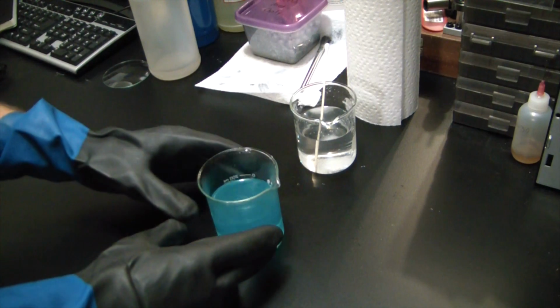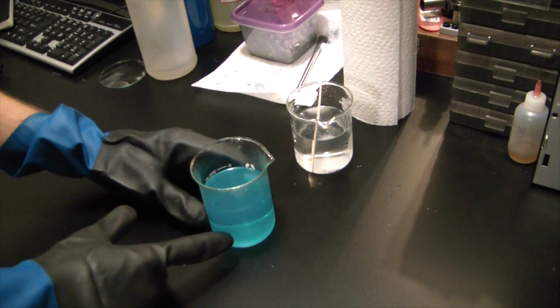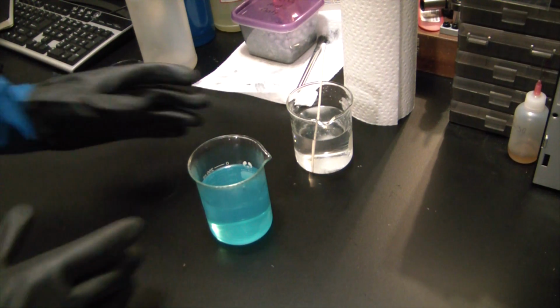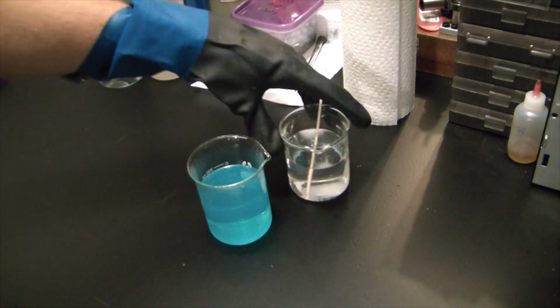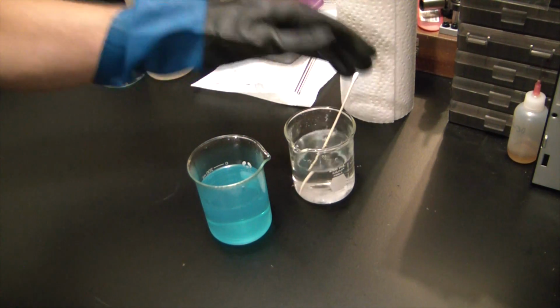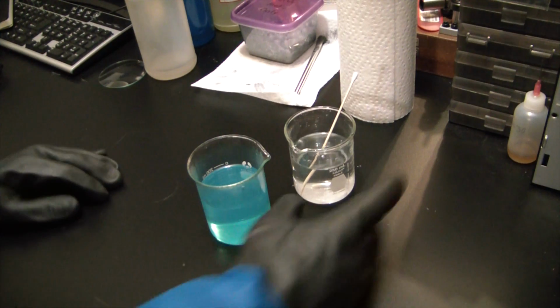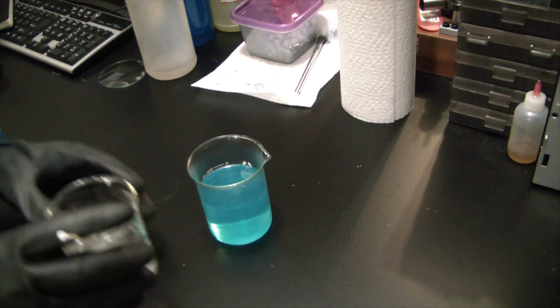Alright, so we've got our solution of silver nitrate here, which is contaminated with some copper nitrate, which is why it has that blue color to it. And what we have here is a solution of sodium chloride, fully saturated. So, sea salt. And what we're going to do is precipitate the silver out of solution by adding it to this.